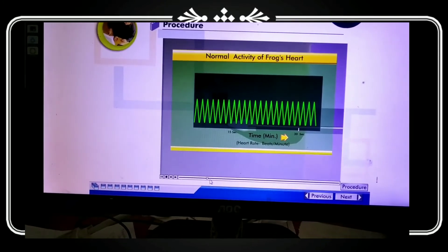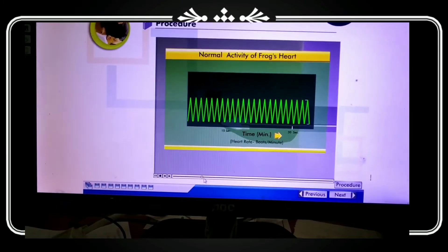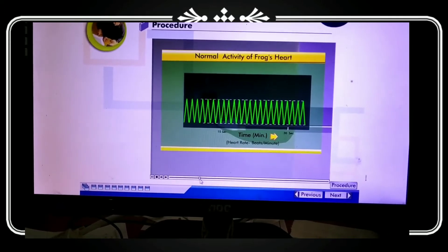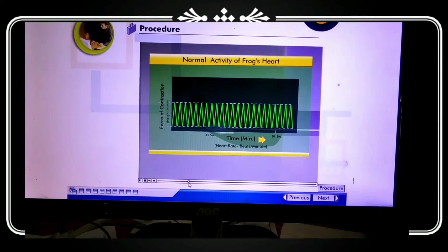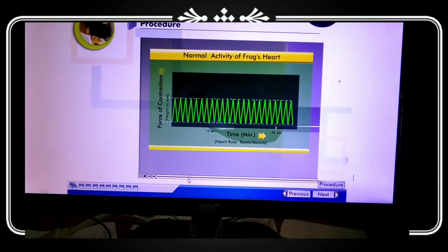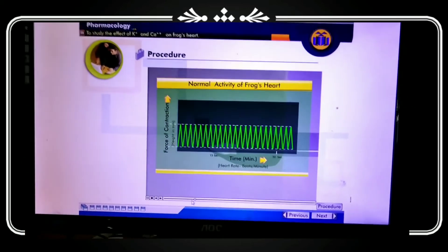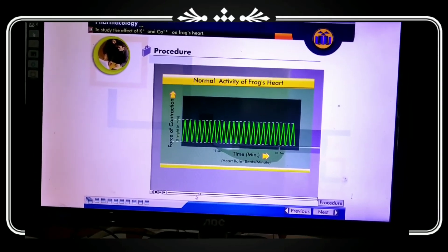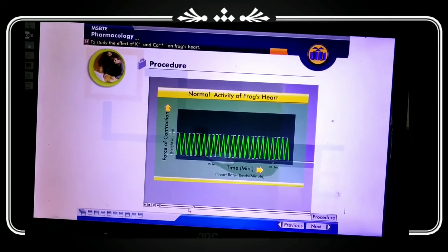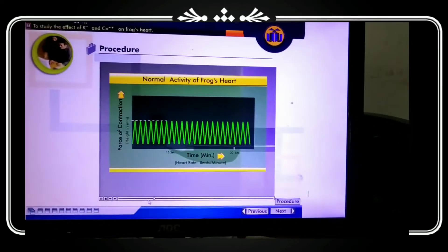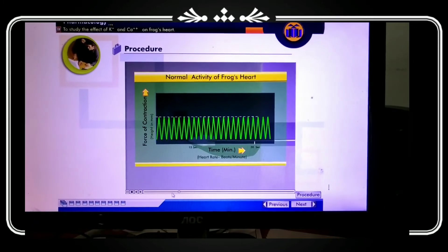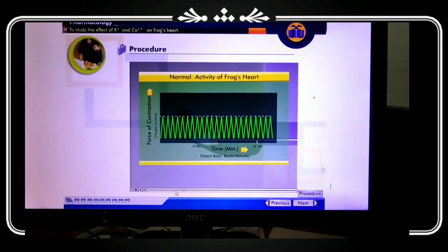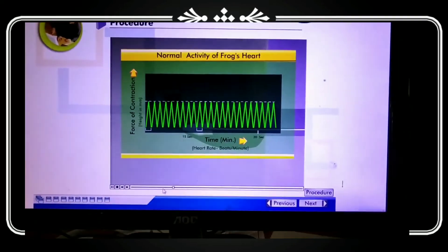The graph shows normal rhythmic activity of the frog heart. You can observe the force of contraction and relaxation — the systole, which represents the force of contraction, and the diastole, which represents the relaxation phase. This is the baseline normal graph before any drug administration.